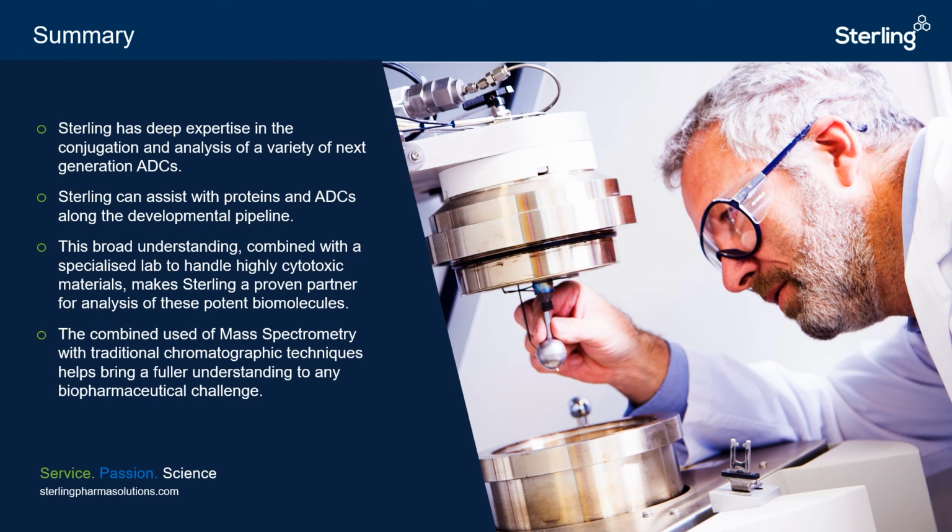We can get really rapid answers using MS or other techniques I mentioned. It's this combined use of mass spectrometry with traditional chromatography techniques that helps bring a fuller understanding to any biopharmaceutical challenge.